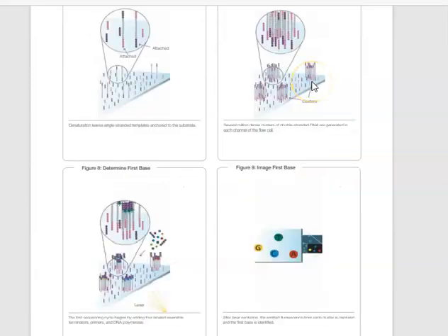So after a while we end up with one piece of DNA that would have landed here, it would have folded over and met the other type of oligo, so it had been captured by one oligo, it will have folded over and been captured by the other oligo. We add DNA polymerase, and that then creates two pieces of DNA. They can be denatured, and you can repeat the process and get 4 pieces of DNA, and repeat the process until you get 1,000 pieces of DNA, all of identical sequence.